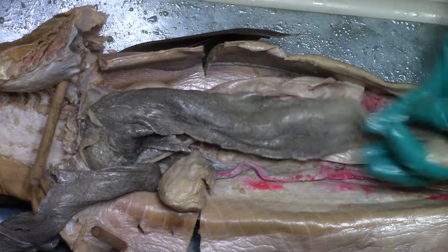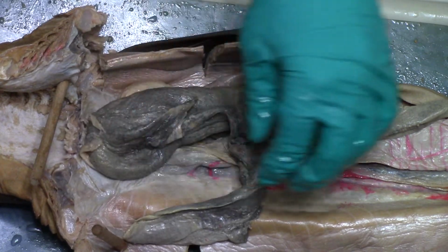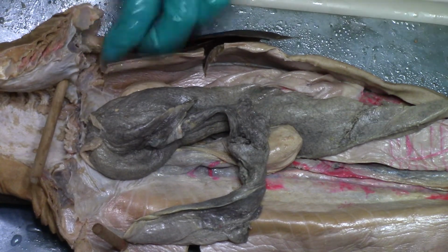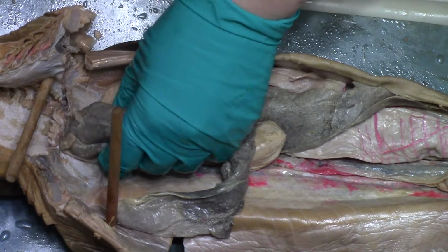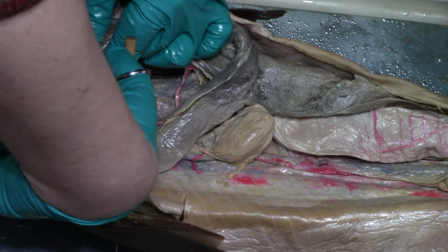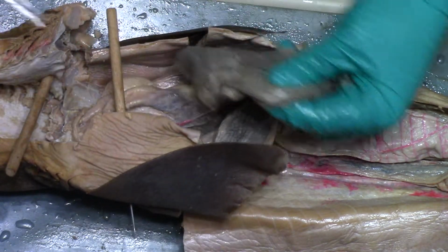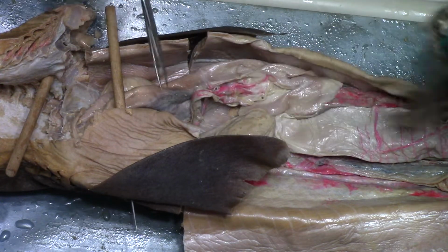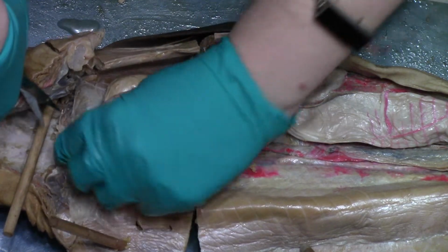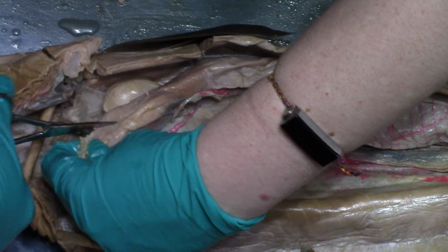Alright, let's do a little bit more cutting and see what we can find. Because the heart should be in here somewhere too. It's usually like here, the heart's probably up in here, beside the gills. Let's remove the liver. I still see that. Alright, and then I'm going to cut into this esophagus so you can see how cool it is.